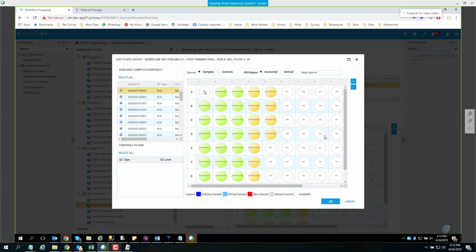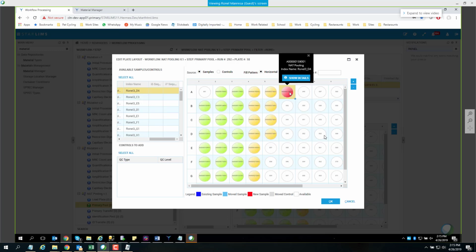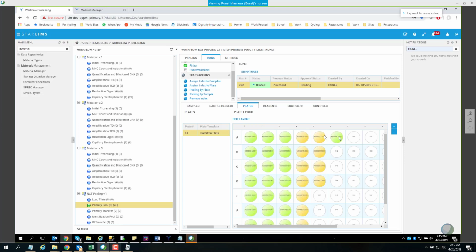It clears it. Here you can see the samples with indexes. And the indexes are in here too. And then when you drag them, they maintain the index. You can reset and rearrange things as you will, and now it's saving and getting the new index. Have the information.